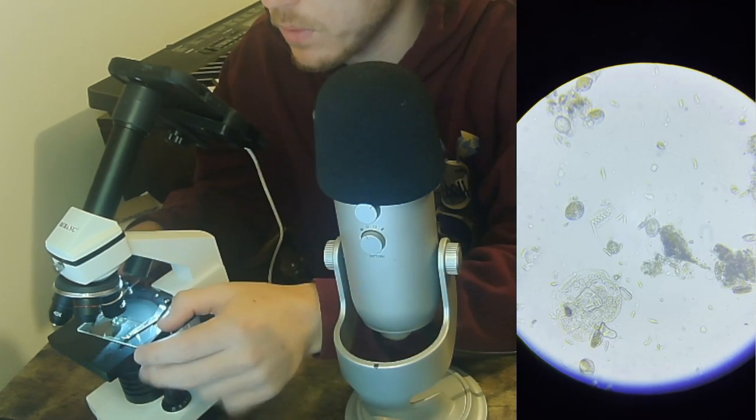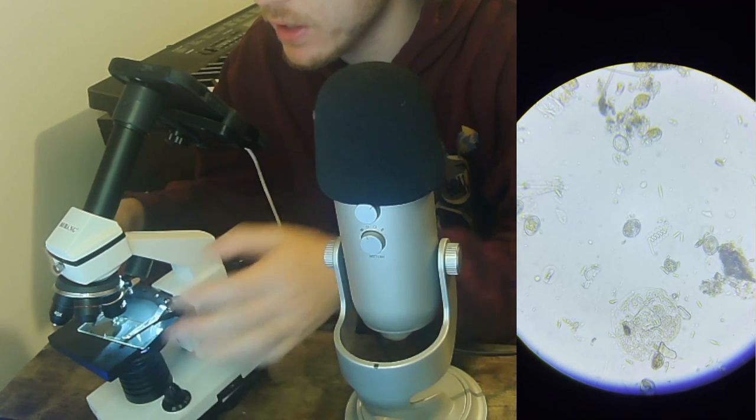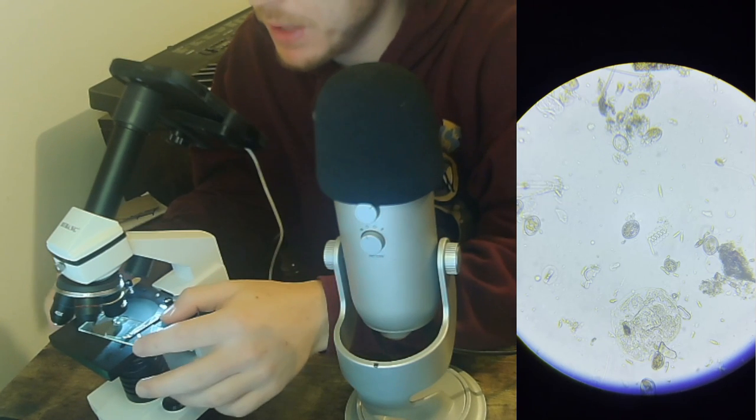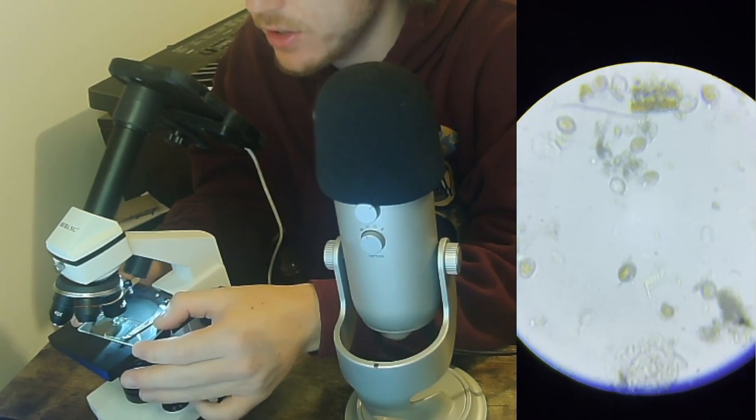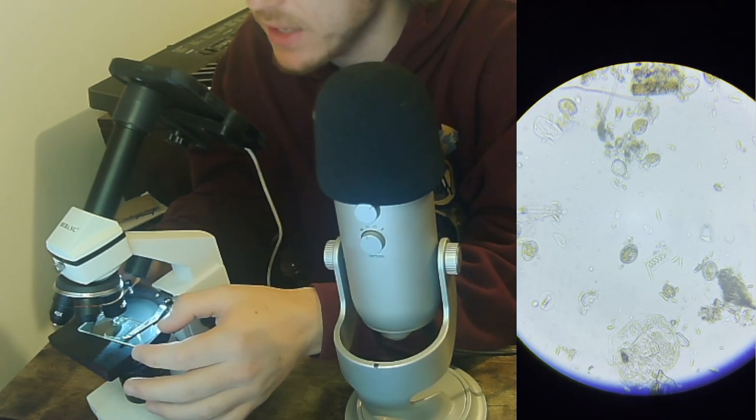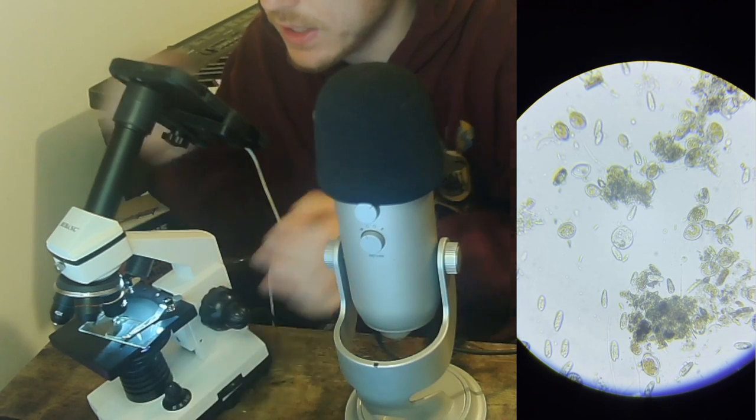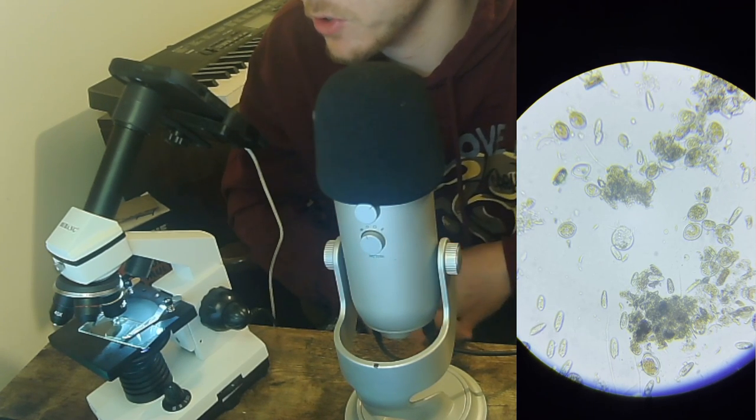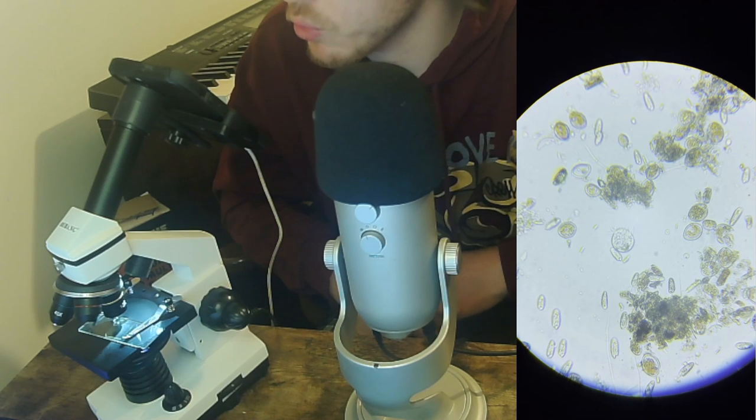He doesn't undulate or oscillate at all, he just kind of moves. I don't even know what this guy is, he's very cool. Whoa, look at that little spiral in the middle there! That looks like the part that the vorticella were attaching to. I wonder if this big blob right here is the head and it got detached totally from its little base, and so it's dead. Look at that, a little ciliate that's not doing too much for once. We found a little ciliate, little circular shaped guy with hairs who's not going berserk running in all directions, so we can actually look at him. Very nice of him.